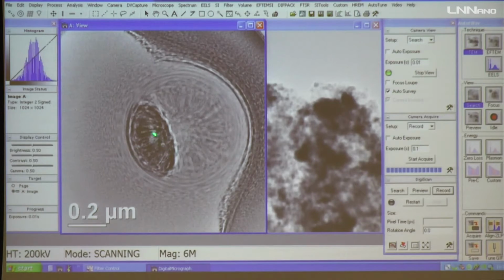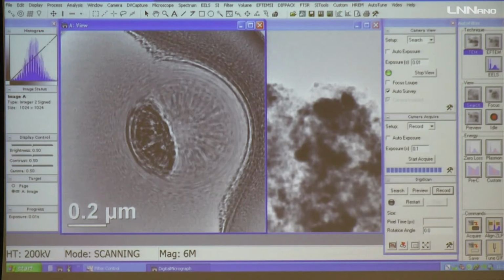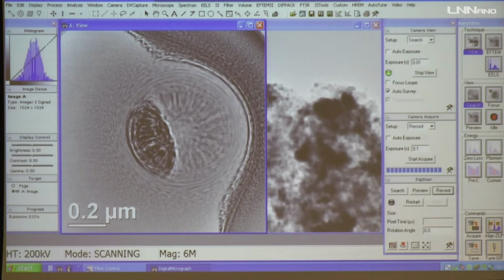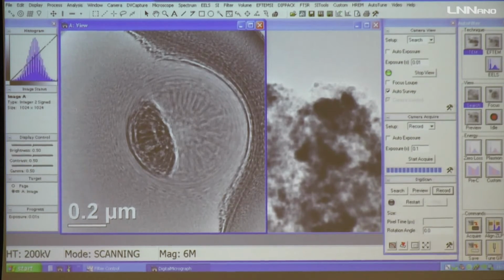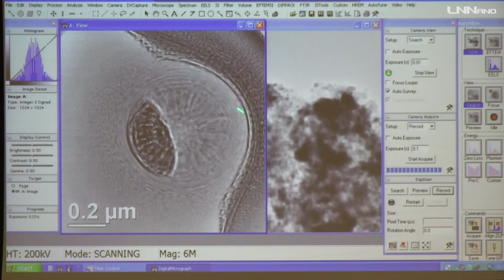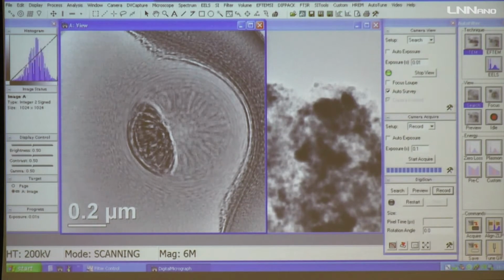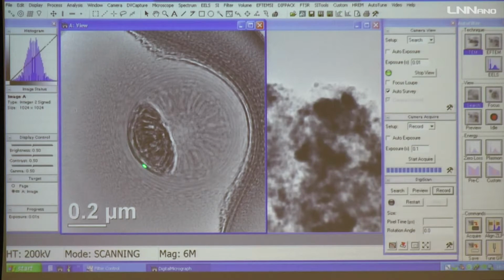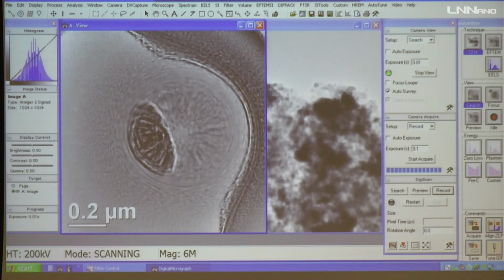We also have here the projection, and in these radial distortions, you start to have what people call the infinite magnification of your material. And when it goes inside the azimuthal distortions, you have this infinite magnification of your sample in both places.